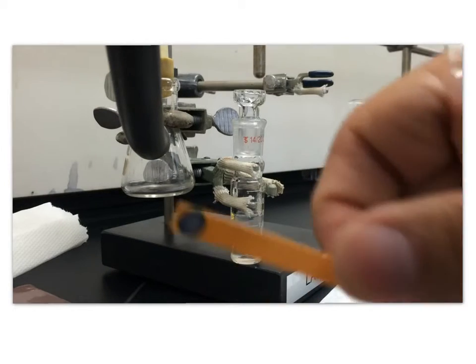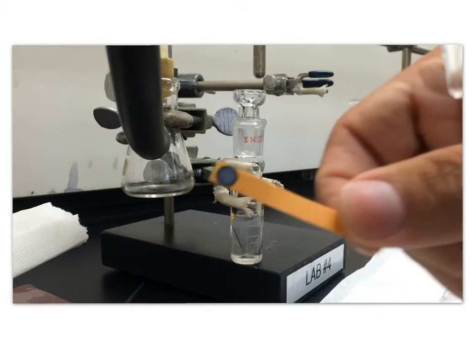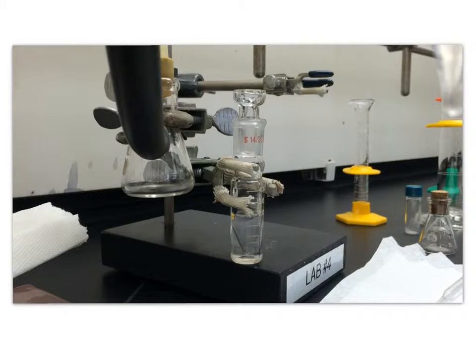My compound did not have a basic compound, so we proceeded with the next step, which was to extract for an acid. As you can see, the litmus paper turned blue, which means it's basic, but no precipitate was there, so we concluded that there was no base present.